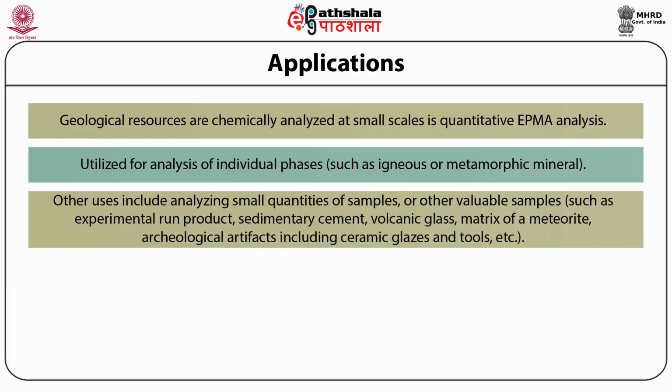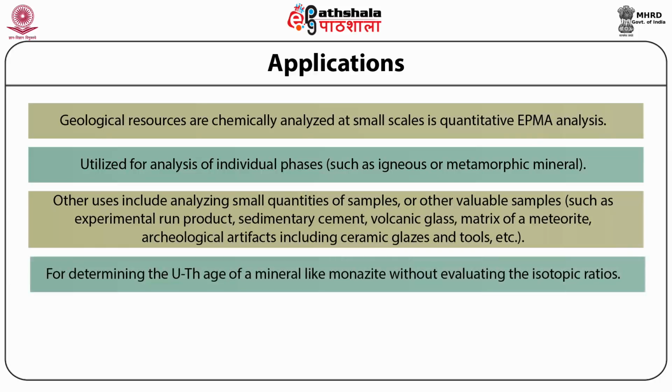Other uses include analyzing small quantities of samples or other valuable samples such as experimental run product, sedimentary cement, volcanic glass, matrix of a meteorite, archaeological artifacts including ceramic glazes and tools, etc. Thirdly, for determining the U-Th age of a mineral like monazite without evaluating the isotopic ratios.